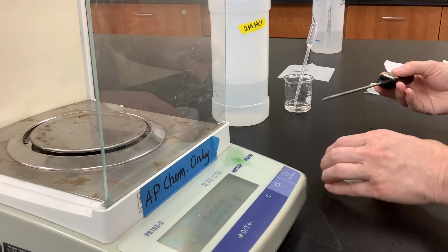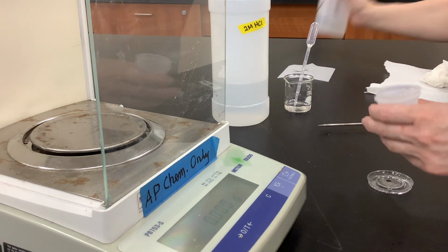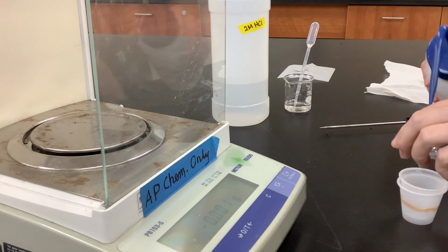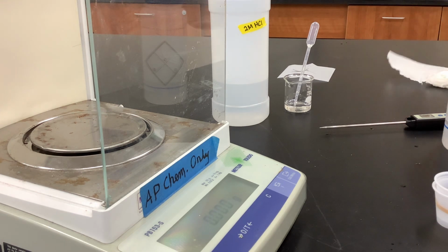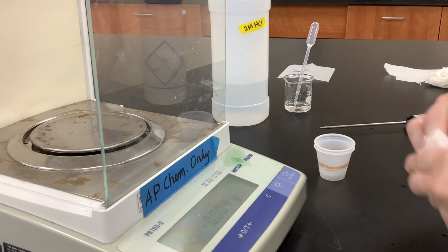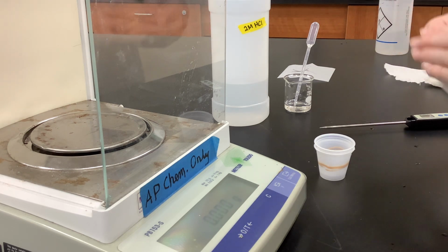Okay, so once again, guys, waste container. Okay, rinse out our calorimeter. Okay, rinse off our lid as well. Okay, put that into the waste container as well. Then take some time to nicely dry on the surfaces. Okay. Lid as well. Okay, and then we're going to do trial number 3. Okay, and trial number 3.